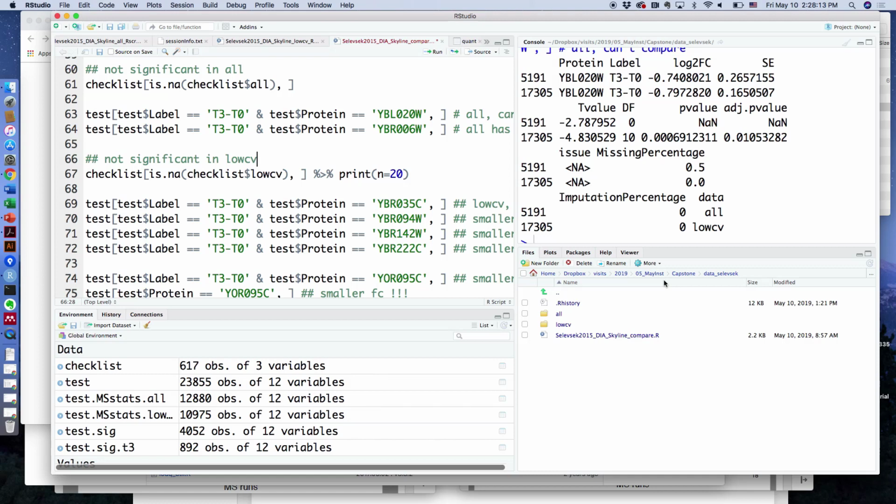Mina, could you remind us how it does calibration, like how it looks at whether or not something is quantifiable, and models the value? That one is not actually our part, that's more Skyline, they are doing that part. Along these lines, there isn't an LOD module in MSstats.